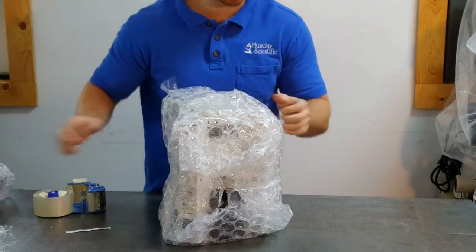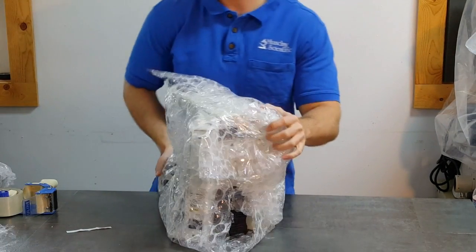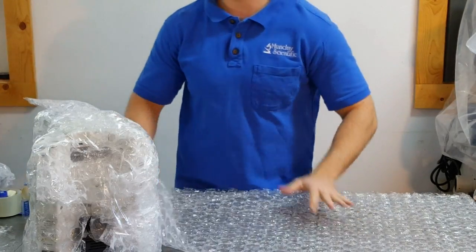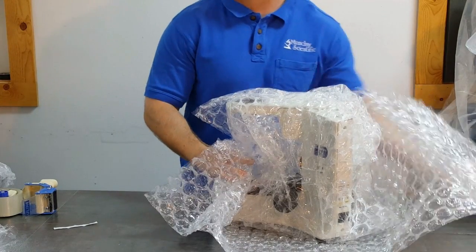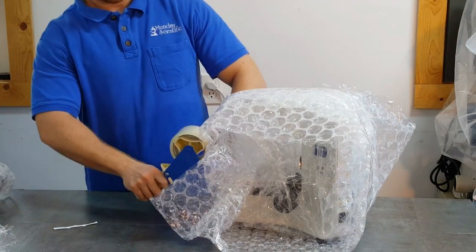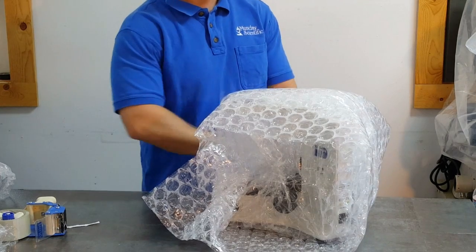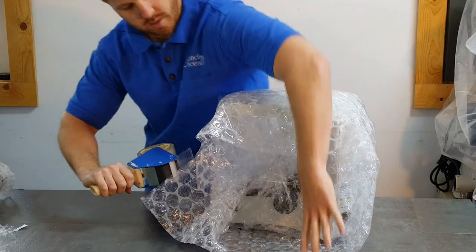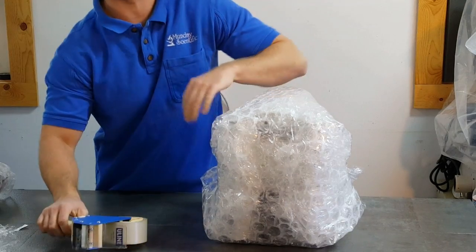Take the stand and wrap it really well in bubble wrap. We're just going to use a couple of sheets for the demonstration, but we recommend you put three to four four-foot pieces of bubble on. I like to wrap in different directions with different patterns so the scope gets more coverage.